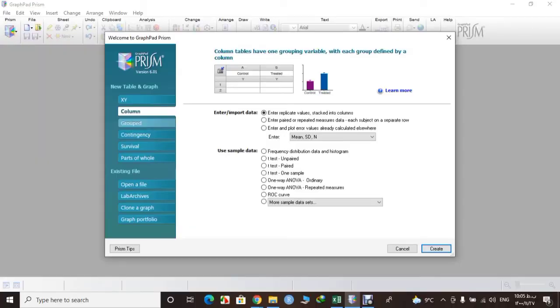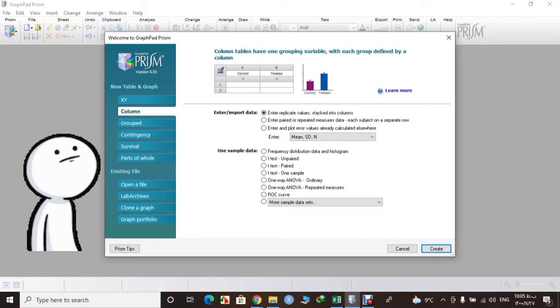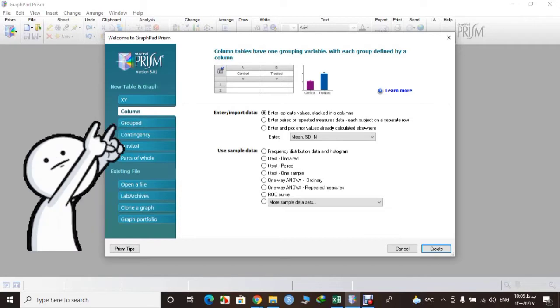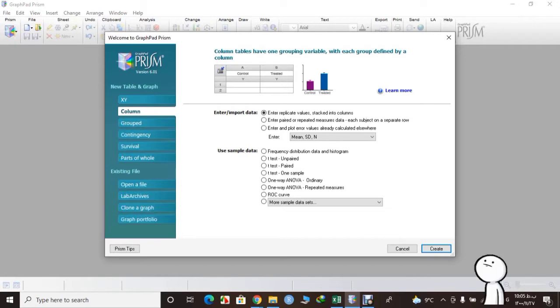Okay, after you open Prism, from this dialog box you need to select column, don't change anything else, and then create.